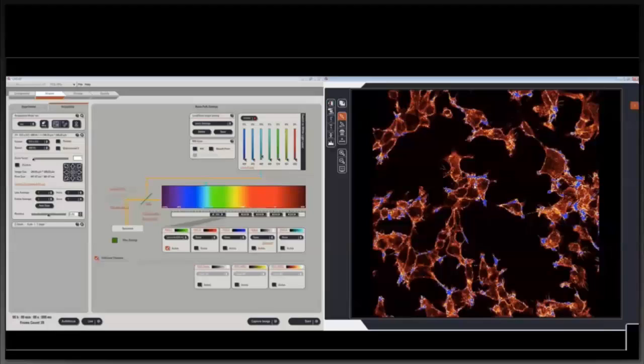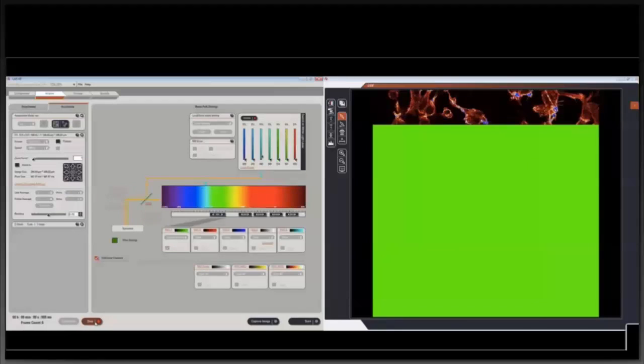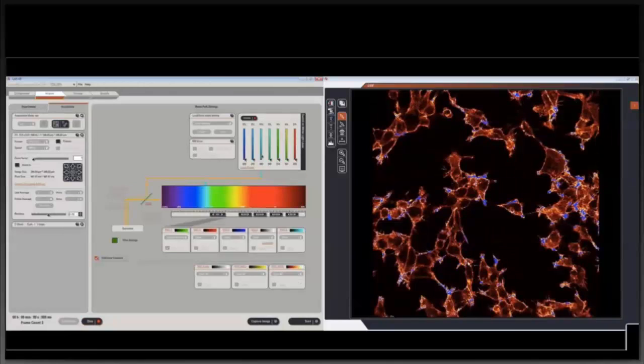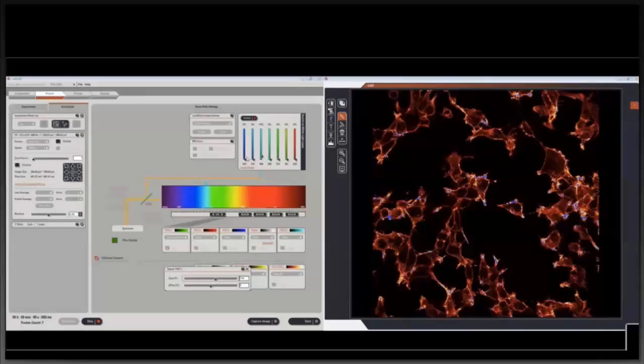If you do, then you have a lot of information in there that you can't do anything with because you're out of your dynamic range. So I know that there's saturation here because there are a lot of blue pixels. If I go live now, there are 2 ways to reduce the signal coming off. We can turn our gain down, and also we can turn down our laser power, which I'm going to do, because turning down our laser power helps with our photobleaching.